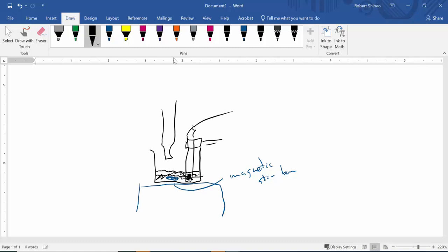You'll have to adjust everything. And then we need the stirrer bar to be in the center of the stirrer unit. And so I'll just move the stirrer unit until it's centered here. And then there's an RPM and a heat. We're not going to touch the heat. We're going to change the RPM on this. So adjust the RPM so that we stir it without splattering. We don't want any splattering. So try to get the maximum stir rate without risk of losing any solution out of the beaker.